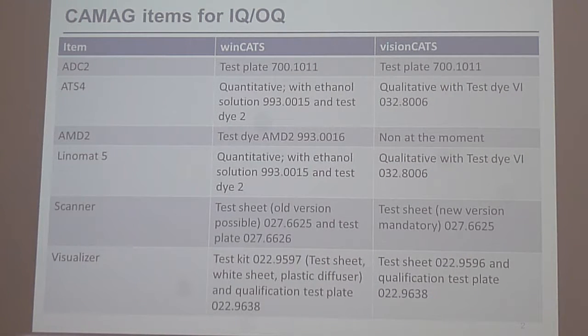We would like to get rid of these test dyes 1, 2, 3, 4, 5. For sure test dye 2 is interesting if you really want to show what is chromatic, so in school or so. So we will keep them for sure. But for qualification purposes, it would be nice to have just one, or maybe two, then we will see. For sure we are trying to make it as easy as possible. But in future, if you ship a standard as a powder, not as a liquid, make sure that at least half of the bottle is powder.